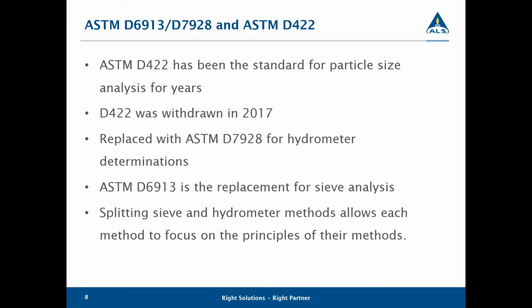So at this point, I'd like to start talking about the different standards that the methods use. For many of our clients, we have used the ASTM D422, and that has been the standard since 1963, which combines sieving, both wet and dry, along with the hydrometer method. Over the years, that method has spawned a number of different classification systems, and a number of different regulators have requested it or use it in their manuals as prescriptive methods.